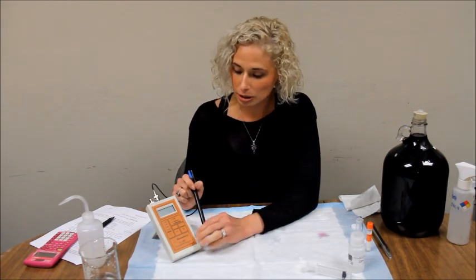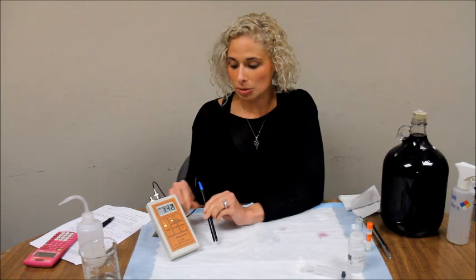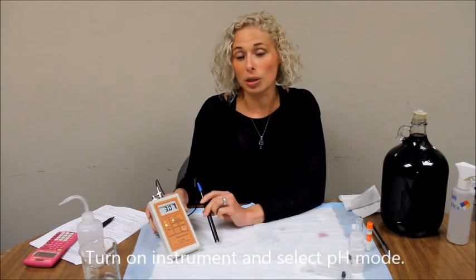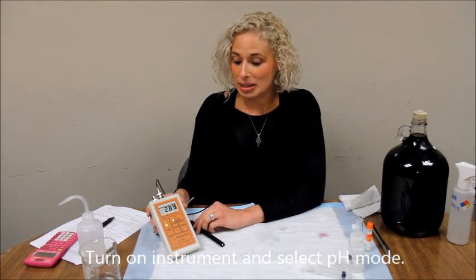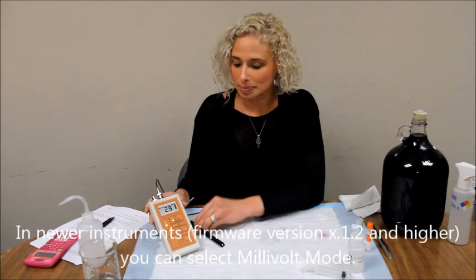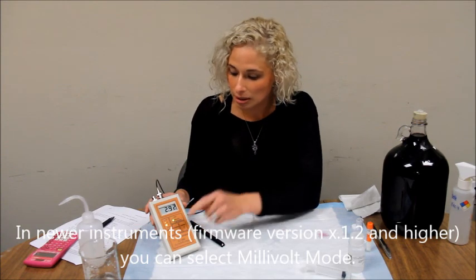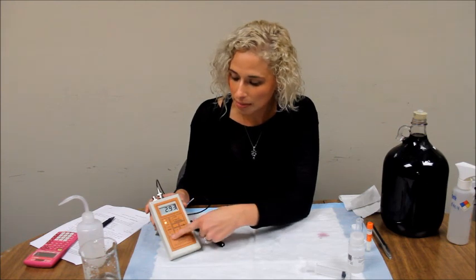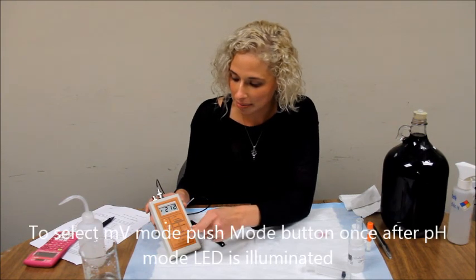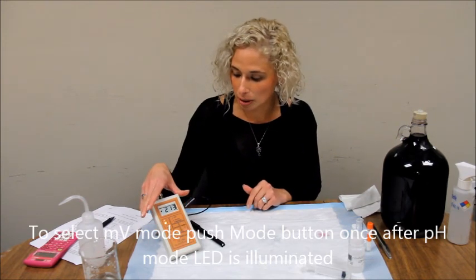First, turn on your instrument and select PH mode, or in newer instruments with firmware versions 3.1.2 or higher, you can select millivolt mode. To get to millivolt mode, scroll through until you get to PH mode, then hit the mode button one more time. The blinking light indicates that you are now in potential mode.